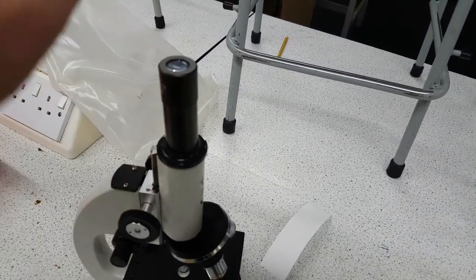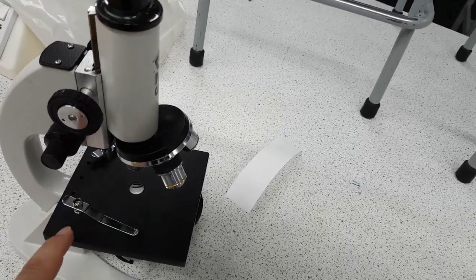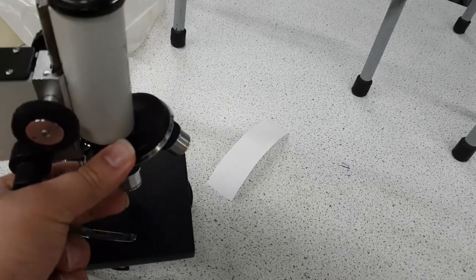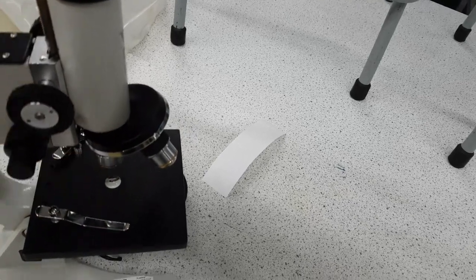This is the eyepiece because that's where you look. Down here we have the stage, that's where you put your slide on. Here we have the objective lens. Now the red one is the least magnifying and it has the biggest field of view.